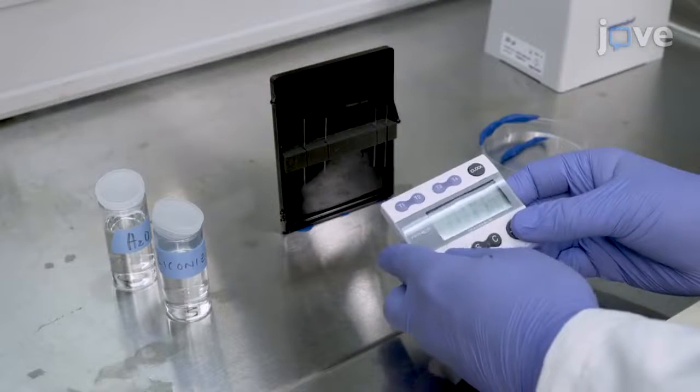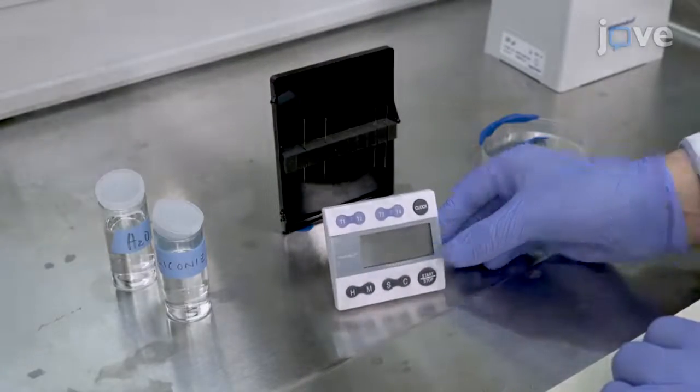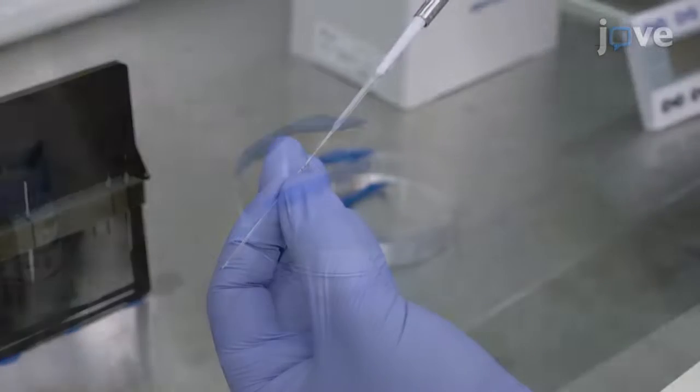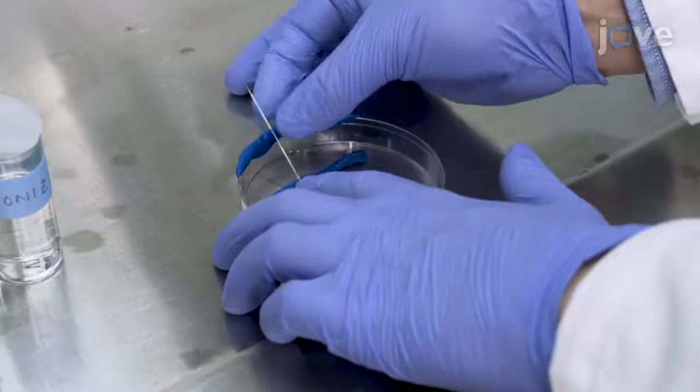Leave the siliconizing agent in the glass needle for 10 minutes before using a new loading pipette to aspirate the solution. Then dry the needles in a fume hood overnight.